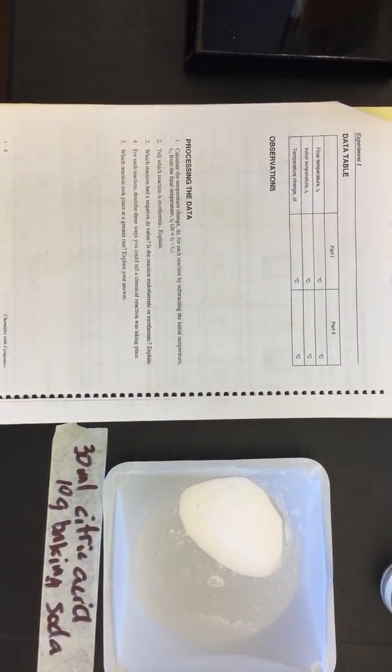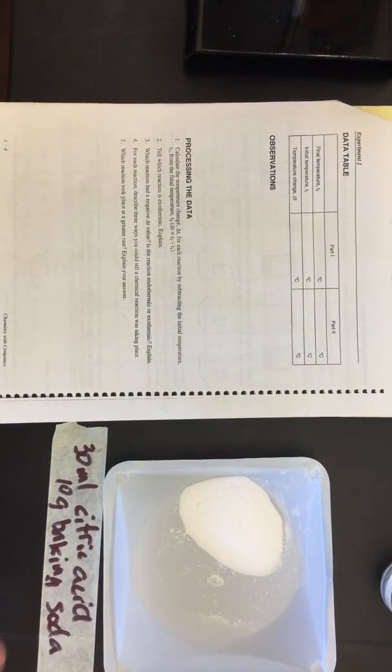Hey guys, have another lab here for you. This is going to be taking a look at endothermic reactions and exothermic reactions to show what happens to the temperature, but also to take a look at reaction rates.